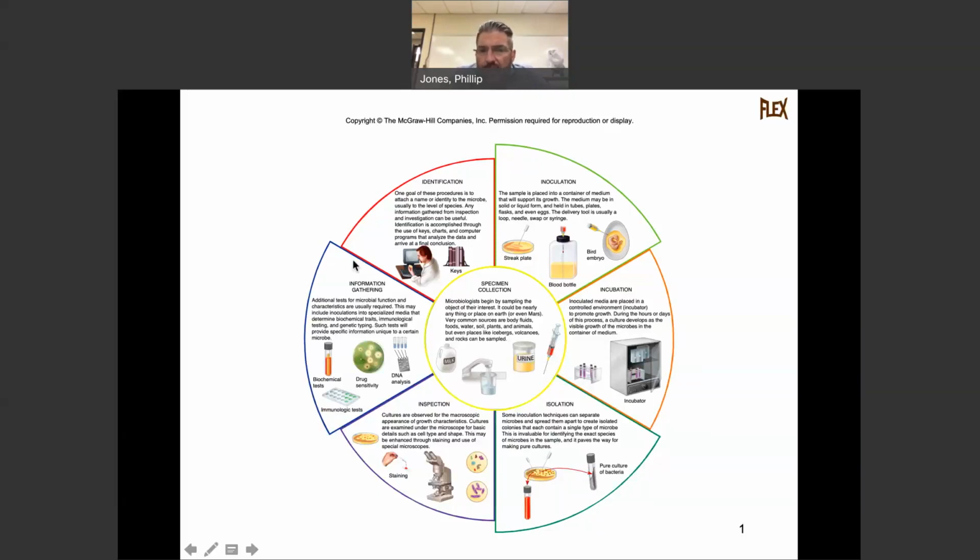All right, so we can collect this in a food sample. We check for coliforms in drinking water, which are enteric bacteria, and we do a coliform count to see how fecally contaminated that water might be. And anyone who lives around the Hamburg area, sometimes they close Woodlawn Beach. They'll just close it down because the fecal or coliform content might be extremely high. We could check urinalysis, or we could check blood. Those are just some of the general things.